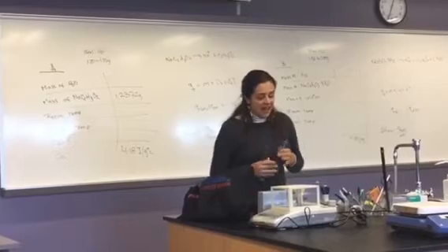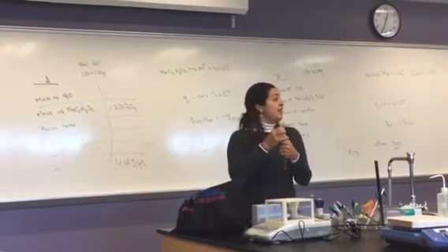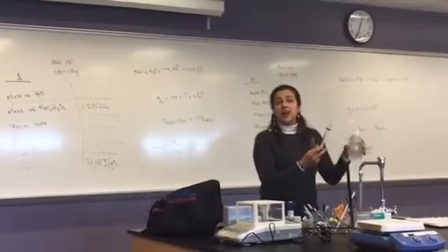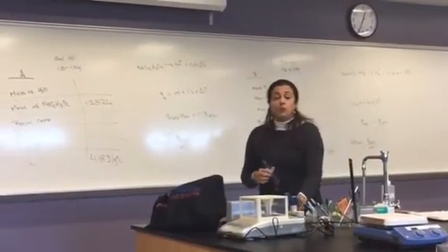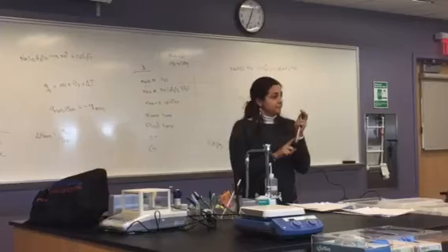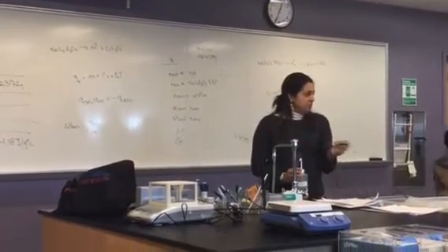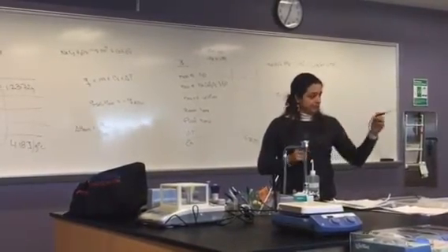Once we have done that, we transfer everything that is here to the test tube. Take a graduated cylinder. We add 10 milliliters of water to this graduated cylinder, and we transfer these 10 milliliters to the test tube. Really fast. You're going to check the temperature of the water before the addition of the salt and after the addition of the salt. The initial temperature of the water, you can check anytime. The final temperature of the water will be once the salt is completely dissolved.